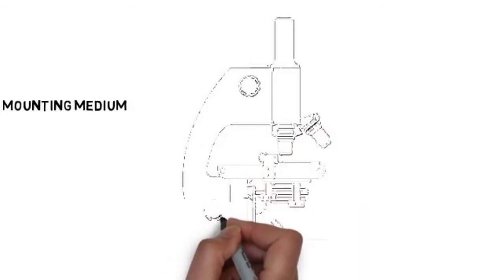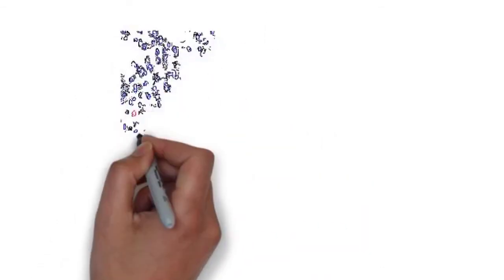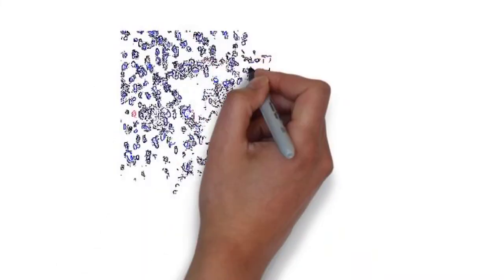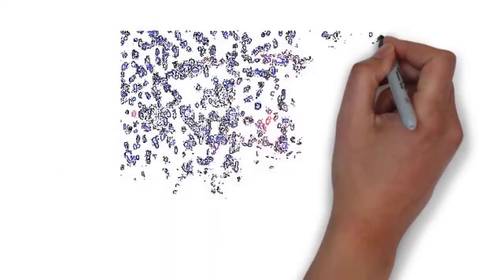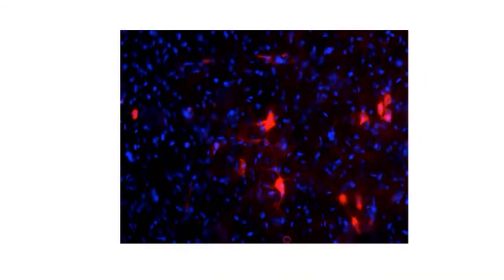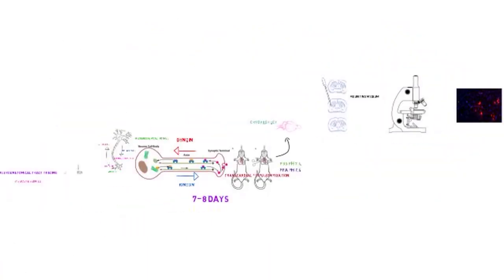The finished slides are viewed in a fluorescent confocal microscope. Fluorescently tagged tracers can be easily visualized with fluorescence microscopy without any additional processing. This section contains anterograde fluororuby labeling in red and DAPI staining nuclei in blue.